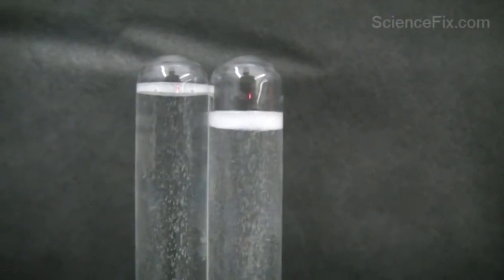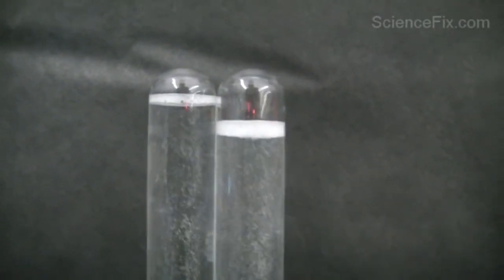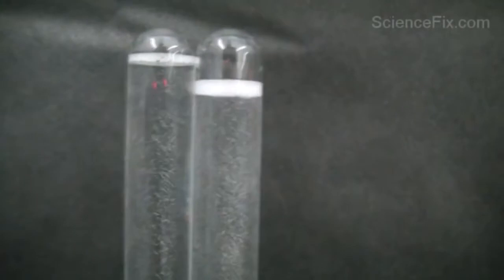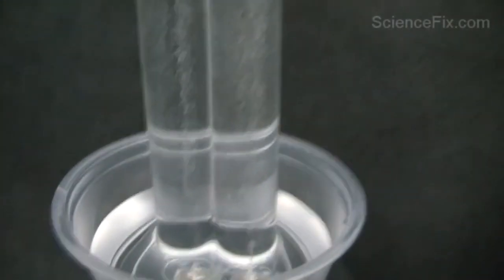you have twice as much hydrogen gas as oxygen gas. This is how experimenters first learned that the ratio of hydrogen atoms to oxygen atoms in water is two to one - a two to one ratio, thus H2O.